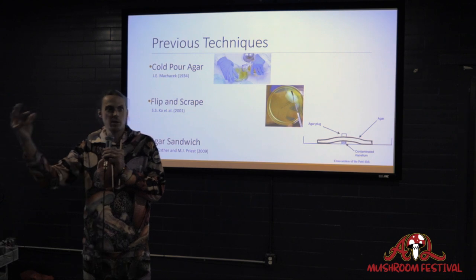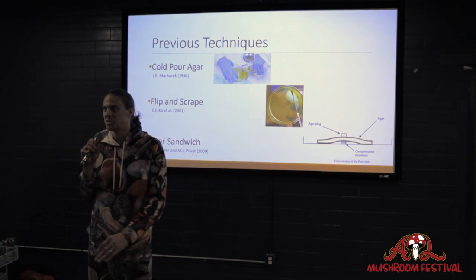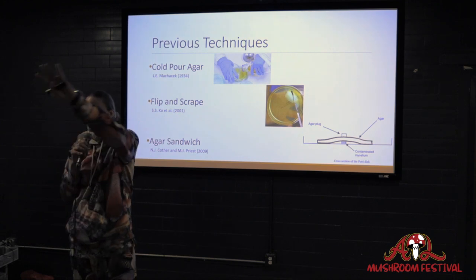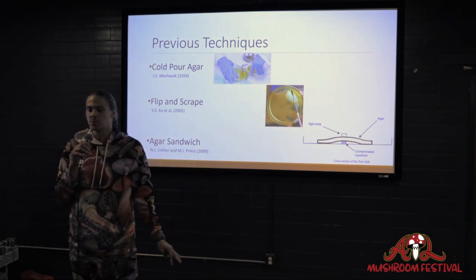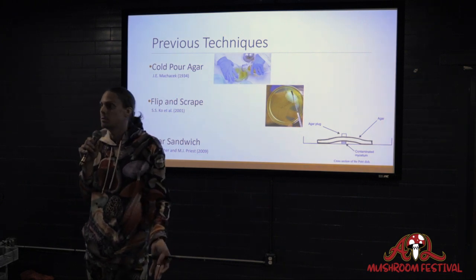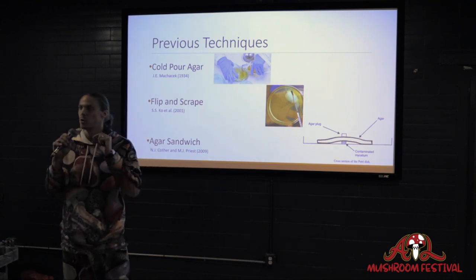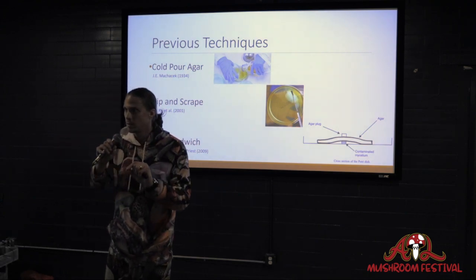So you take that agar plate, you put it in a bag, you crush it up and you shake it. Well, you've just taken that bacteria and smeared it across the entire bag. And then all of a sudden, the whole bag goes to goop and you don't know what happened. You're like, well, the plate looked clean, right? And so the theory behind this is that the bacteria cannot grow through the agar.